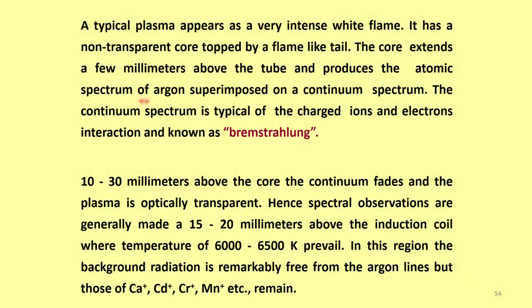So, we have to pick up only that line. Whatever line wavelength you choose for the estimation, there will be a certain amount of argon emission associated with that, that is background. Okay. So, the background is that of argon and the spectrum is that of a continuum spectrum.